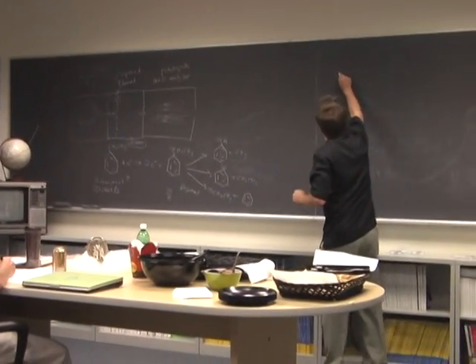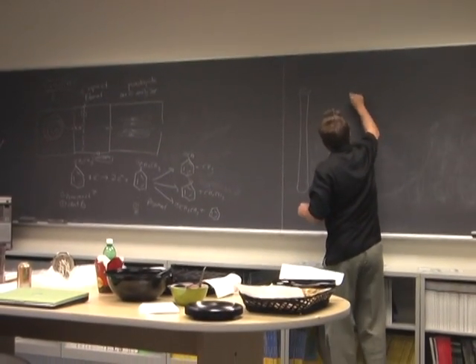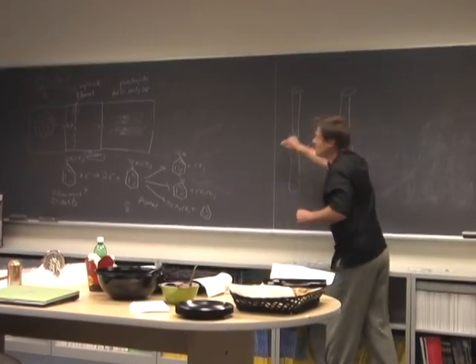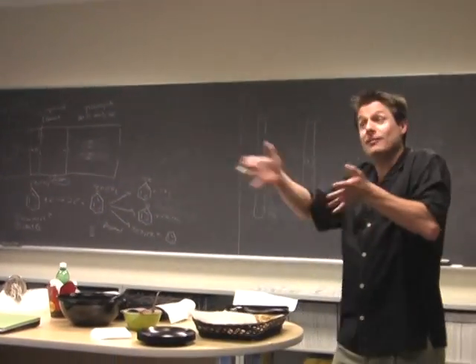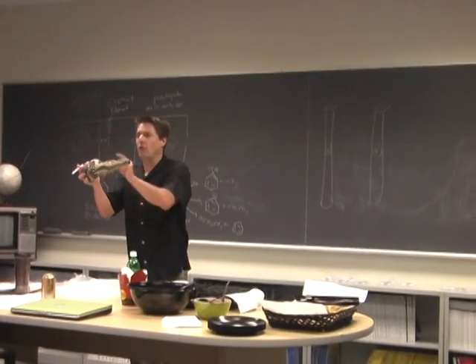So let's spit these through. Let's take the first 2 poles, the 2 positive ones. I have 2 positive poles here, and I'm going to attach a direct current to them that I can move from 0 to whatever value I want. So it's a variable DC current. I can increase it or decrease it all I want. That's what all these wires are for. These are all voltage controls.